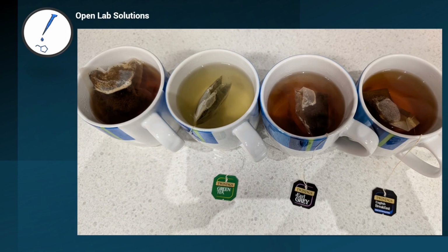I took 1 milliliter aliquots of each of these teas, placed them into my autosampler vials. I did make a further dilution of 1 in 10 as at these concentrations the caffeine was quite strong, so we needed to do a little bit of dilution, as you will see from the results. I also used my boiled water as a standard control. So in total we've got 5 samples: the blank, the Yorkshire, the green tea, the Earl Grey tea, and the English breakfast tea, which we then submit on our mass spectrometer.